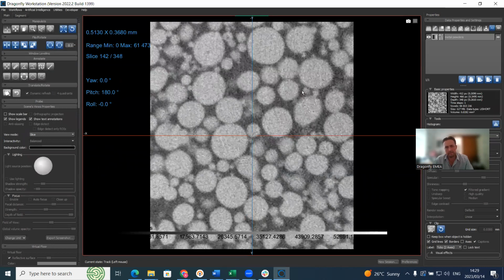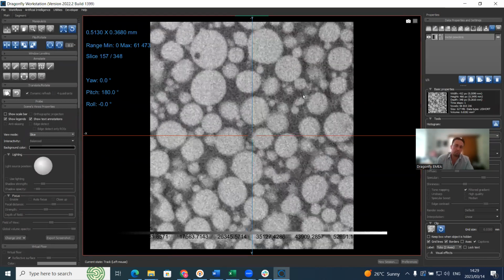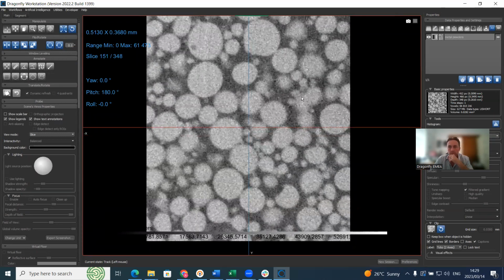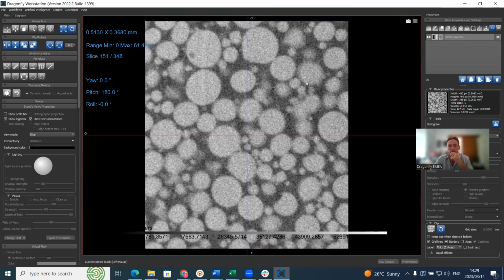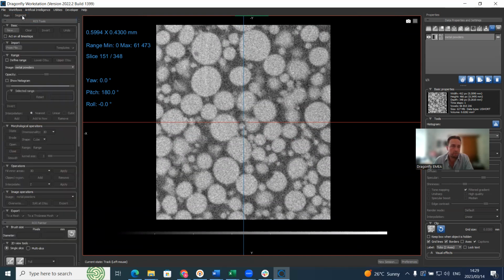Obviously, it needs denoising, because to make any analysis on this, any segmentation will be difficult, and therefore the analysis won't be very good because of the difficulty in segmenting properly. So what we do here is, Noise2Void works very much like training a deep learning segmentation model, except that you need to give it a mask, and that's all. Like in this case, we can make the mask with a region of interest.